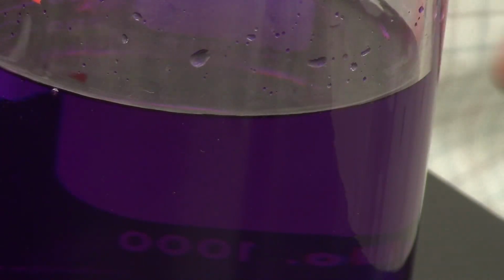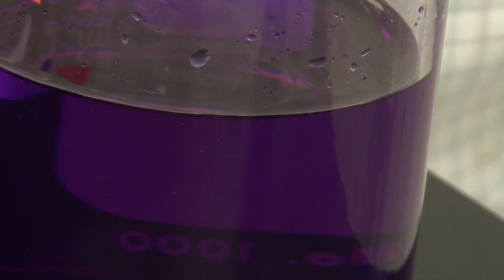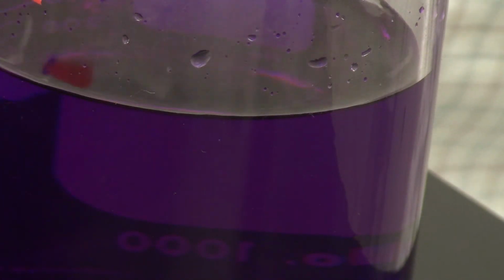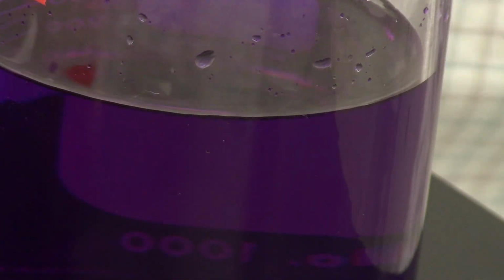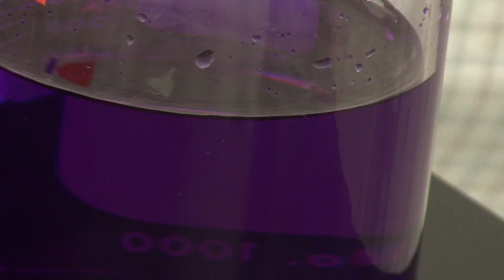So here's the cool thing as far as how light interacts. We see this as purple because basically it absorbs all the colors but purple, and that purple light is what bounces off and hits our eyes. So what we're going to do is take some of this and react it with some sodium hydroxide, and as the crystal violet reacts, it fades out. And we're going to use a device that measures how much light is being absorbed. So that's going to be the next part.